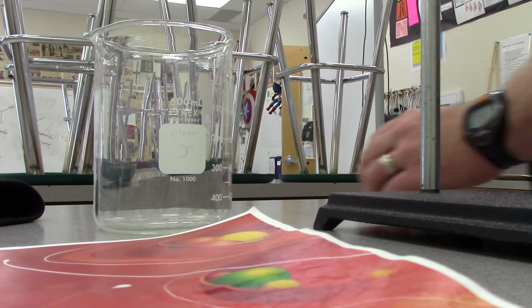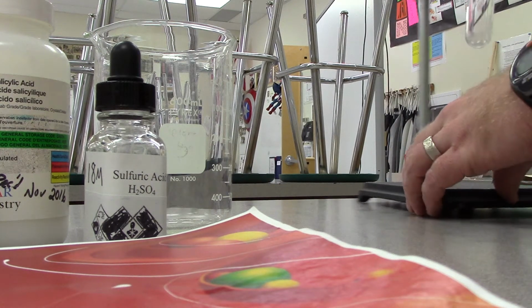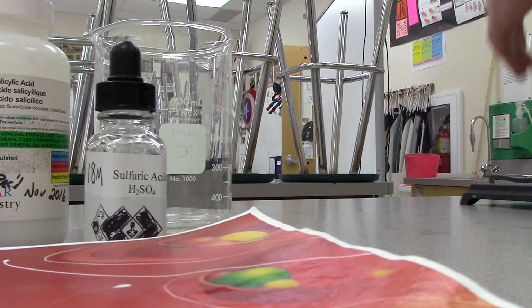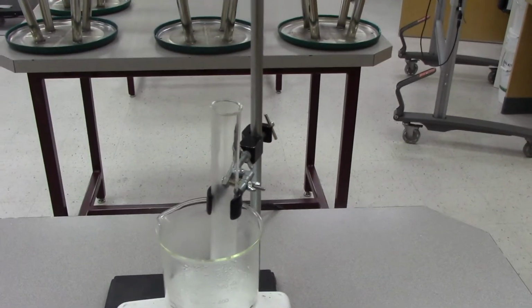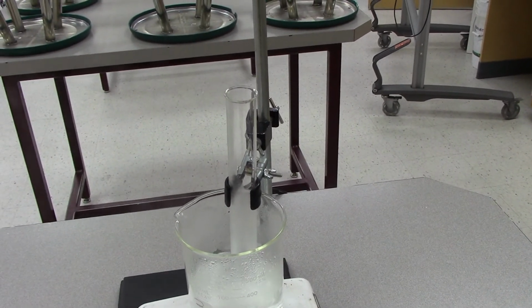And I'm actually going to do this. I'm going to leave the hot plate on low, and I'm going to move the test tube over the hot water bath. I'm going to just have it sit in the hot water bath slightly. So there's my setup here. The test tube is where I'm going to have the ester.